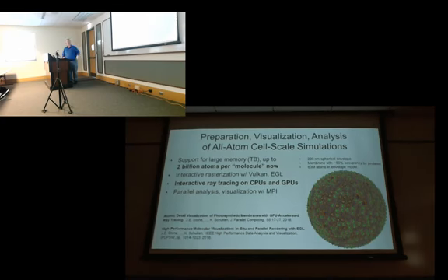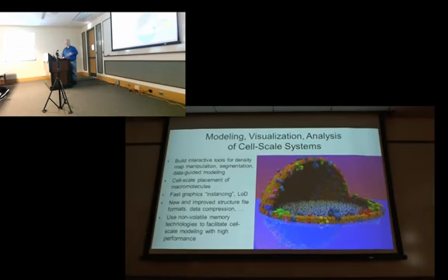And so going forward, the OpenGL display window you see in VMD now works on your typical laptop, but we're going to be putting a lot of energy into enabling a ray tracing based renderer in that window as an alternative. And for these huge structures, it'll actually probably run faster than OpenGL does.